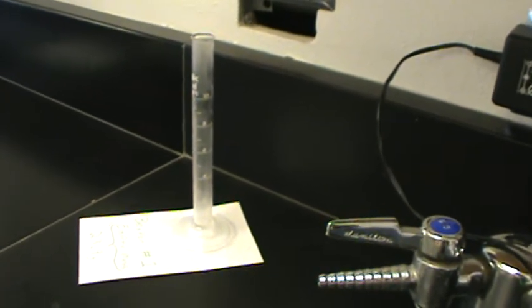And mass divided by volume is the density. And if there's a meniscus, a little dip in the liquid, which there's not now because it's empty, remember you want to read the bottom of that meniscus. I'll do a quick video over there at the document itself. I'll mention that one more time.